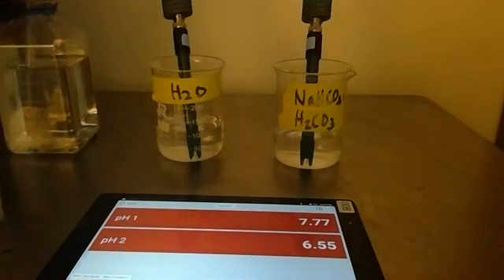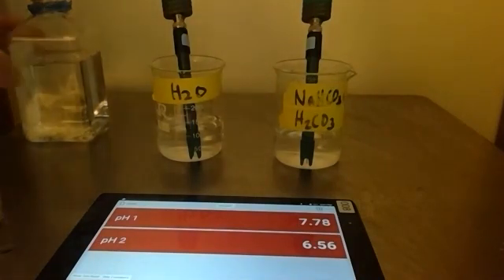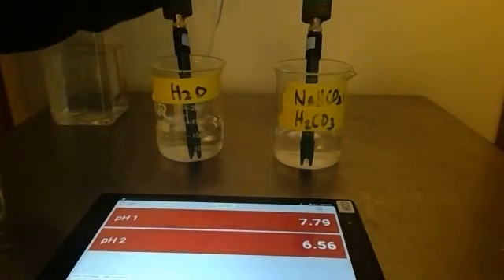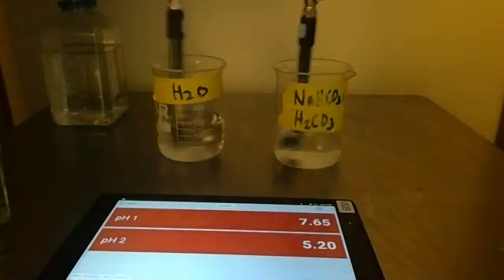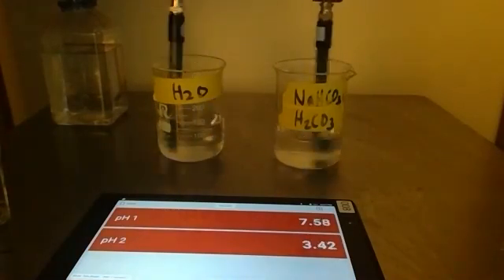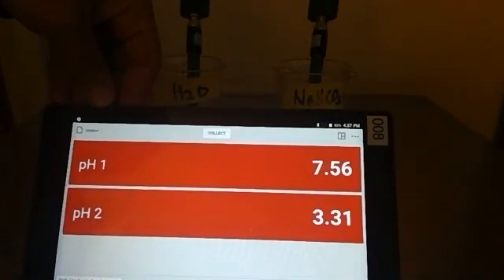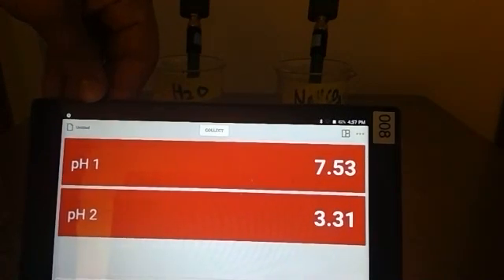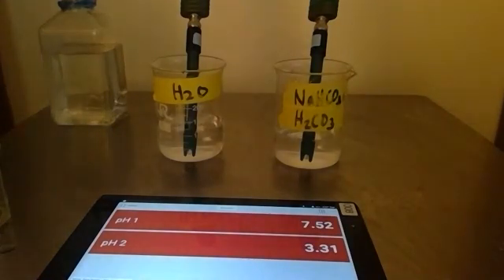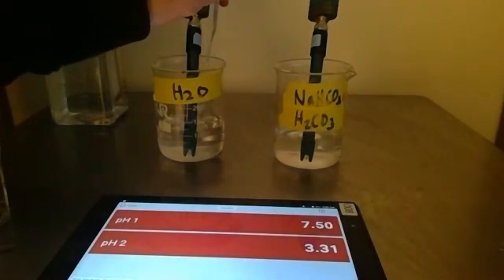We're going to add this drop wise to both solutions and see how it responds. I'm going to just go drop by drop, two drops at a time. We'll do two drops in our water, followed by two drops in our buffer solution and stir. That buffer solution pH hasn't changed very much, 7.5 about. But look at our water. It went from 6.5 all the way down to 3.3. That's about a pH 3 change. That's huge, just from those two drops.